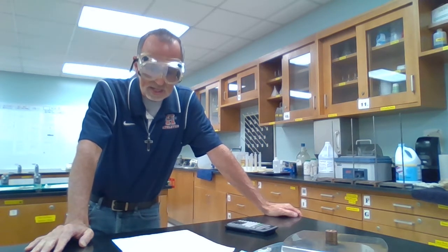32.63 grams, 32.63. Now, we're going to check the volume of each of those pennies. I just said the volume of the pennies really hasn't changed. So theoretically, the volumes in this column should be the same or nearly the same as they were before. But keep in mind, reading a manual device certainly has its subjectivity. So maybe it'll come out the same and maybe it'll be close. But either way, we'll go with what we got.